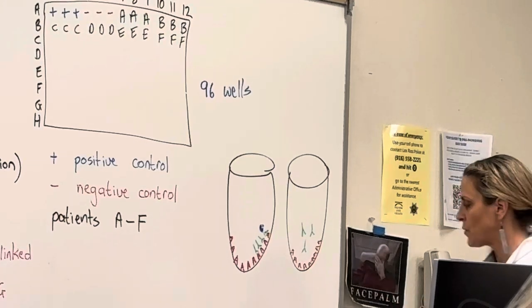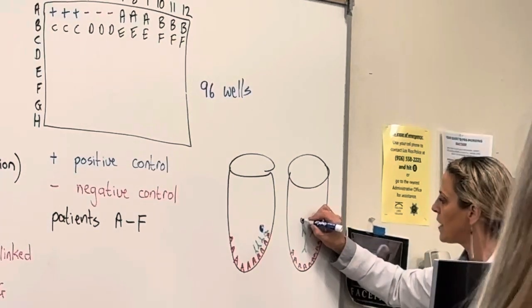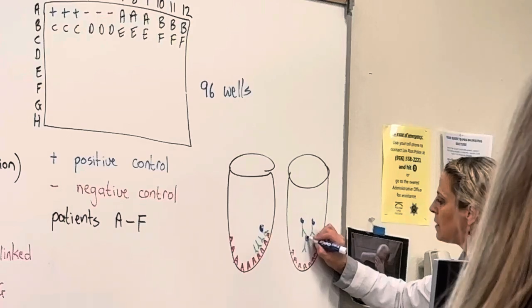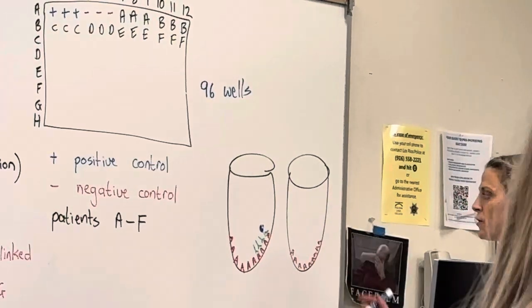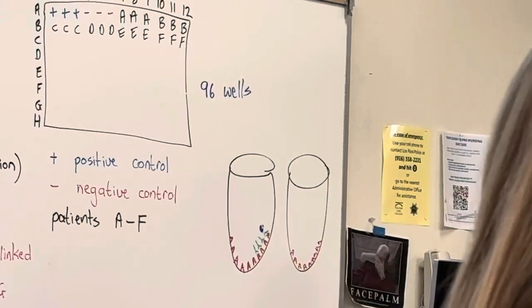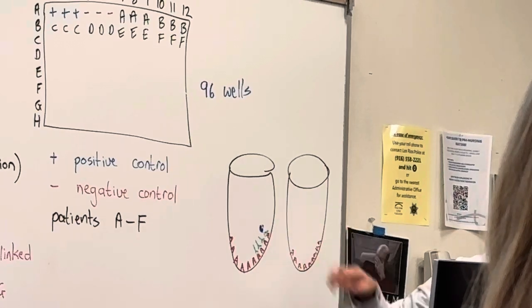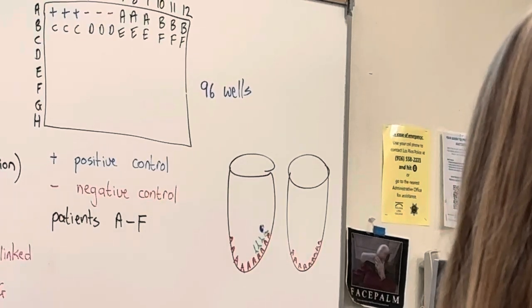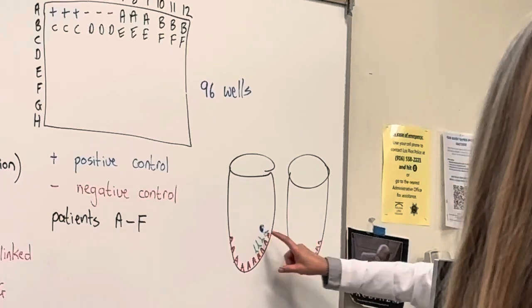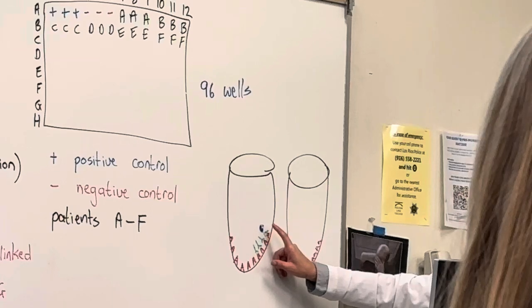Regardless, now what you're going to do, here's the enzyme linked to the immunoglobulin. When you wash it, all of these just come right up. So when you add the chromogen, it doesn't change color, because there's no enzyme in there to change the color of the chromogen. The enzyme is what changes the chromogen's color, and if there's no enzyme, the chromogen won't change color.